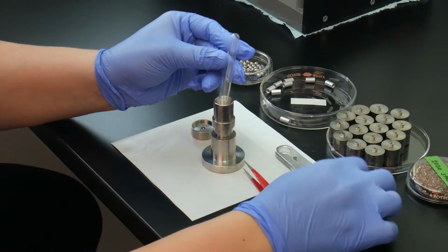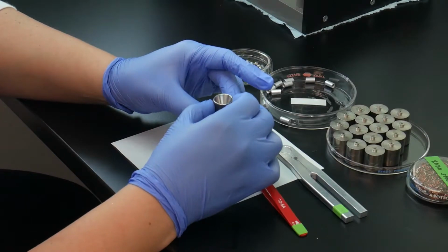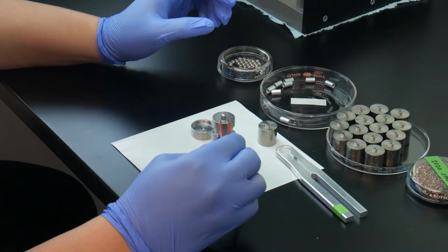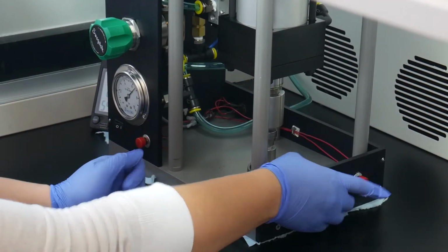Once they're in CO2, they get converted to elemental carbon or graphite using an iron catalyst on our graphitization lines. Those are custom built in-house. We designed and built them here at the University of Ottawa. So this graphite is what ends up in the accelerator, ultimately, on the AMS, and that gets pressed into what we call a target. So all that small amount of carbon that we're producing, about 1 milligram of carbon, gets pressed into this target, and that's what gets loaded on the AMS. That's what we measure.